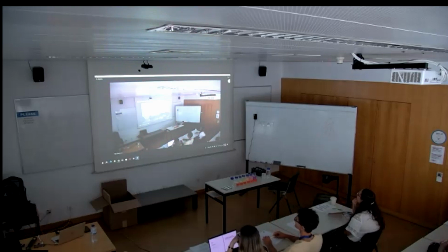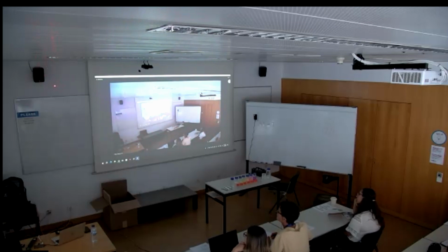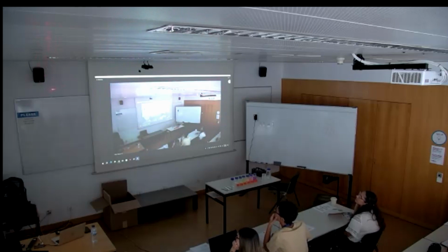So I will show you. The spot, and then I put the wire in front, and it's very easy to see. Okay, you see it? We still have a spot. So the light is not divided in two. It's actually even brighter than if I remove the wire. And then there is what is called a diffraction pattern: several dots that are bright, dark, bright, alternated and symmetric. Do you see it?